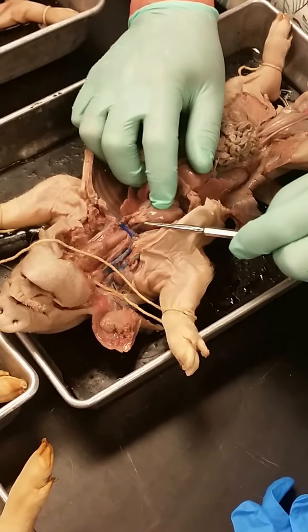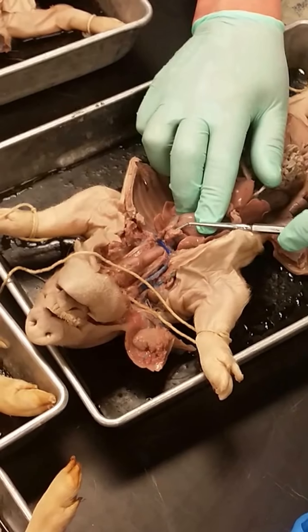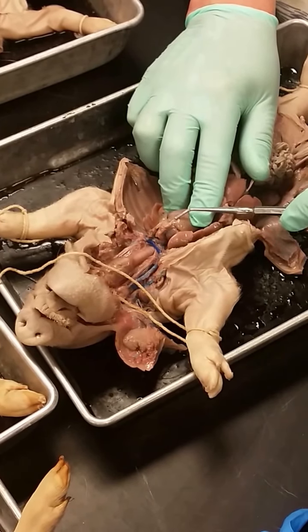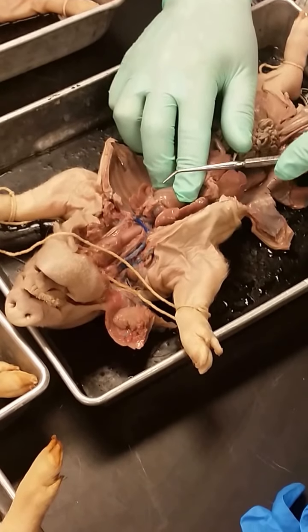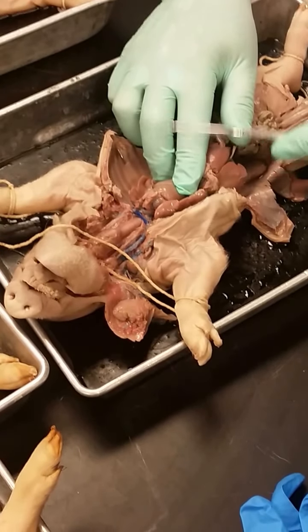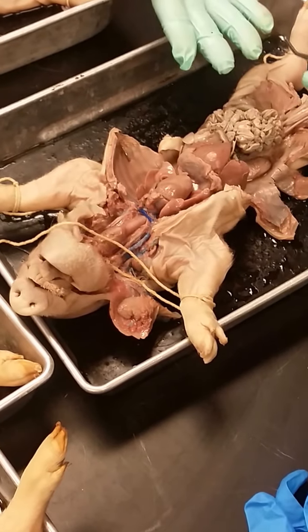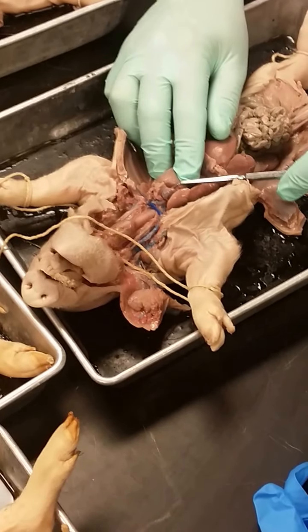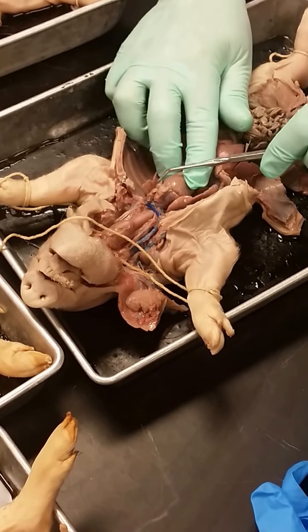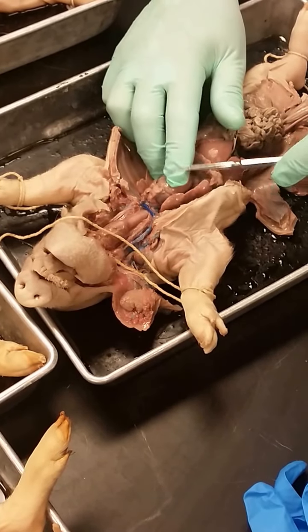Of course, in terms of the heart, right on the surface right here, see that? That tissue, superficial, that's the thymus. And this is where T lymphocytes mature. They go through a maturation process before they get released into the circulation. And then, of course, on either side, these are the atria. This is the left atrium, right atrium.